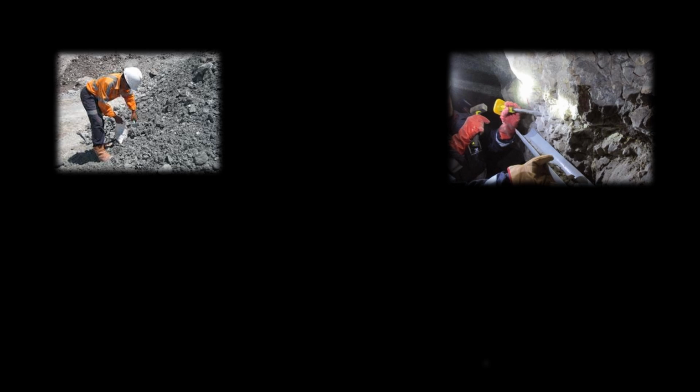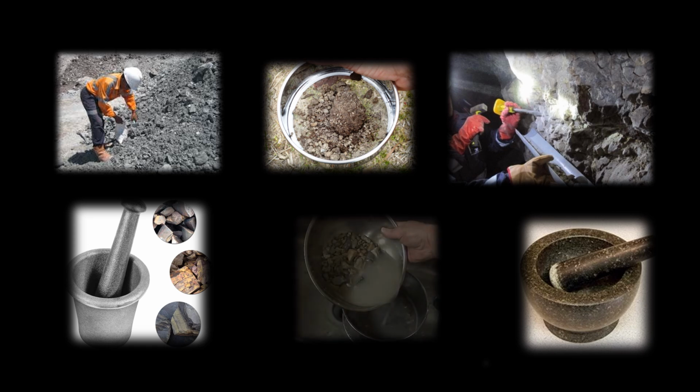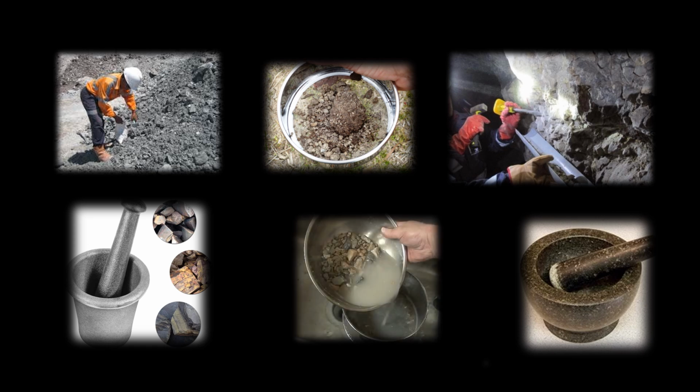You will need to reduce each sample size by pulverizing and grinding until it is reduced to about minus 200 mesh. Each sample will need to be washed in cold distilled water and decanted to remove unwanted organic material such as tree needles, leaves, twigs, etc. The samples are then evaporated to dryness using low heat well below the boiling point. Then each sample is homogenized by thoroughly mixing each sample separately. Do not combine the samples into a single sample.